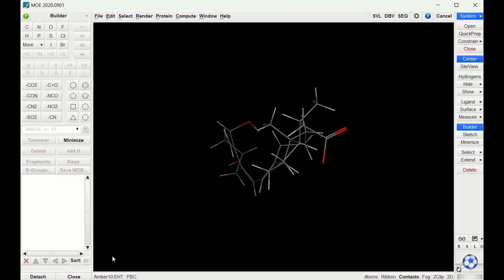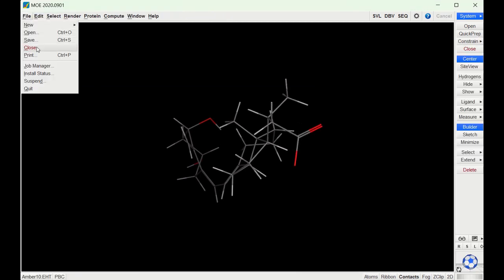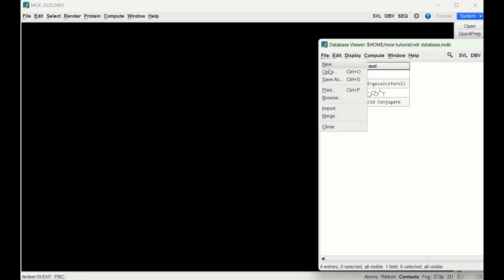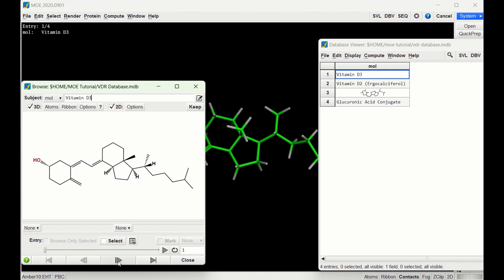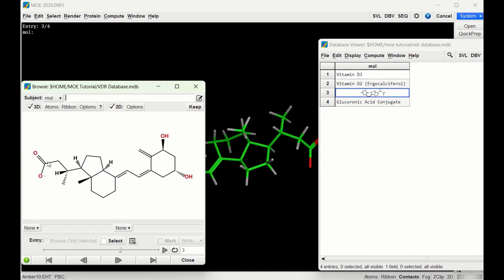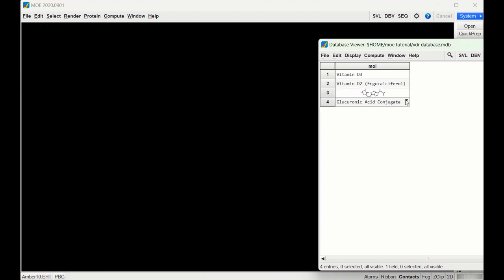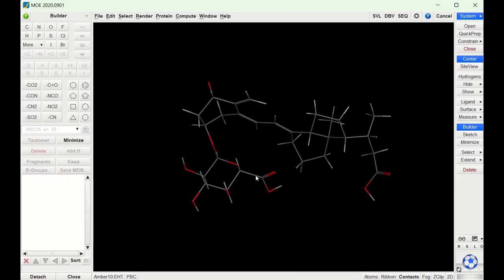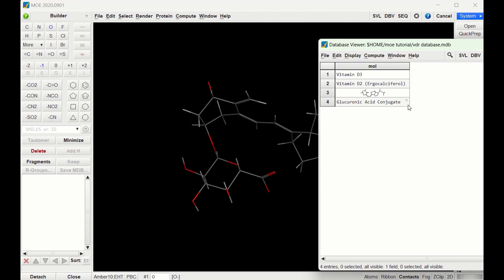We can then check to make sure it's been deprotonated. I'll close the structure, go back to our database, go to Browse, and navigate to calcitroic acid — and we see that we now have the negative charge on the carboxylic acid. So let's do the same thing with the glucuronic acid conjugate: send it to MOE, go to Builder, press on the oxygen of the first carboxylic acid and press negative one charge — deprotonated. Then press on the oxygen of the second carboxylic acid and deprotonate that too. Then go back to our database, press the dropdown, Get from MOE, and OK. Now we have deprotonated all the carboxylic acids in the molecules.